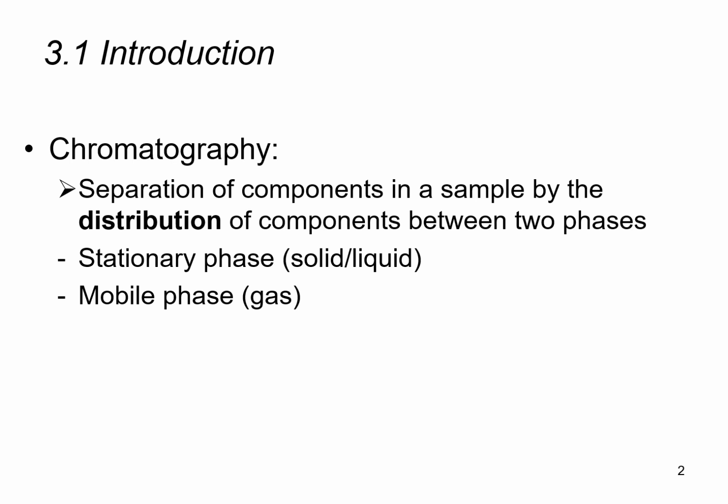Now the mobile phase is typically what allows the sample mixture to move through the instrument, and the stationary phase is the phase that the sample interacts with, and based on the extent of interaction, some chemicals interact more, some chemicals interact less. That will lead us to separation.